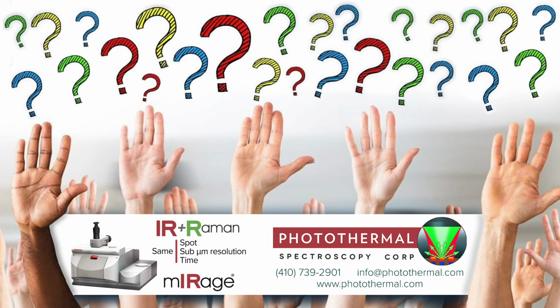And though I didn't ever explore subtracting that, I think the potential exists to be able to subtract that out and still make use of the features underneath the nucleic acids and the carbohydrates. But even if you don't subtract it, and that's what we did with the paper, there's still a lot of information in the protein region, which was more than enough, and also, of course, out into the CH region as well. So that was actually more than enough to achieve excellent high 90s classification accuracies.